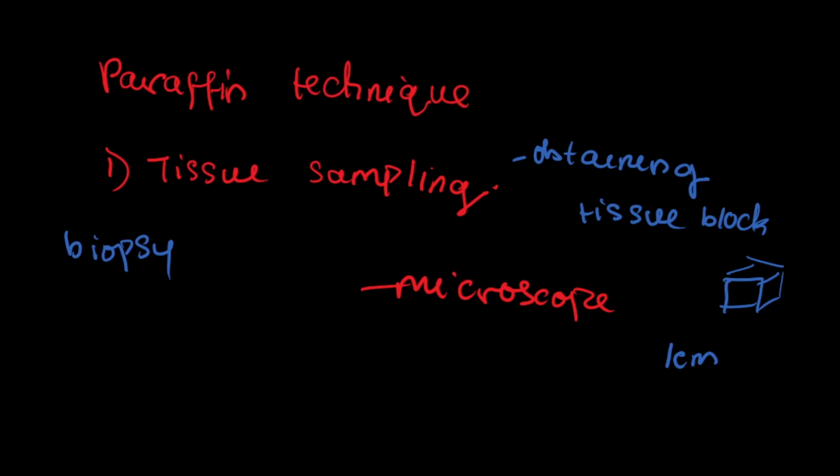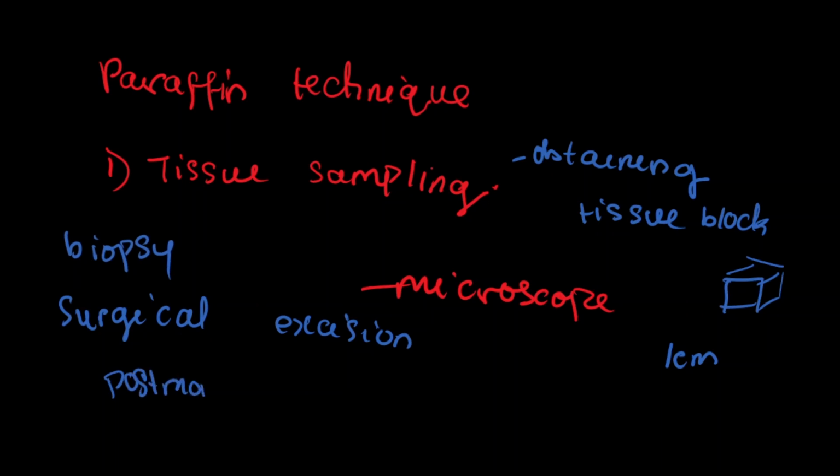Okay, it could be obtained by surgical excision or surgical cutting, excision, as well as post-mortem dissection.